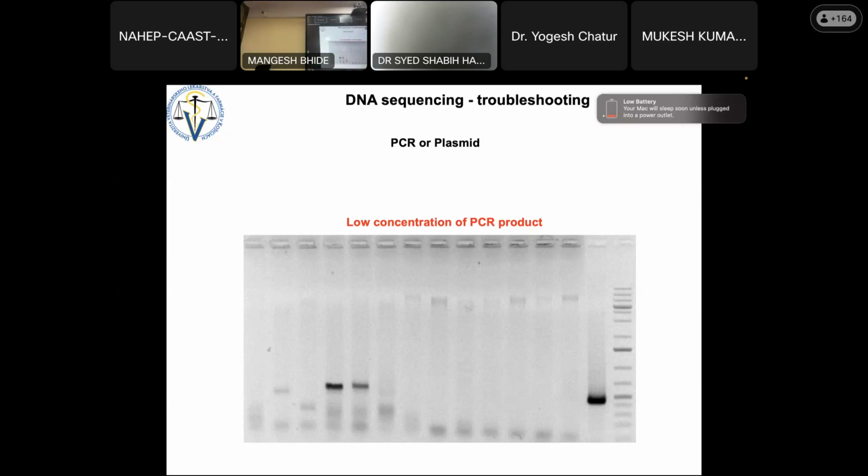And for example, you want to recycle the agarose now. So you take that, you boil it. It will get melted soon, and then you just pour that into slabs, in one plate, and you cut the slab. Now, for example, you cut the slab, and you know that this slab corresponds to 200 milliliters.